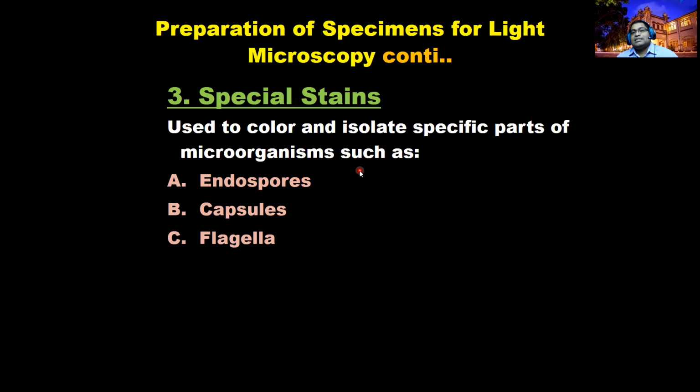Special stains. Other than these stains, you can also use special stains to stain certain structures of bacterial and fungal cells.